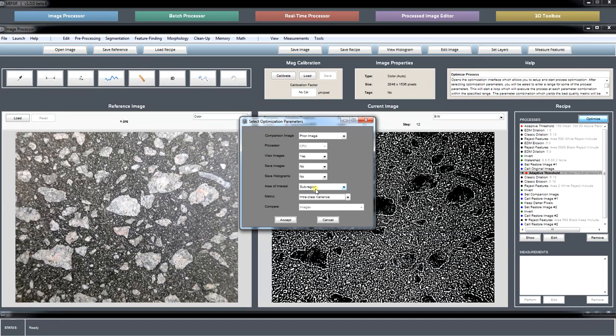So now you can imagine two histograms, those pixels that were turned black, those pixels that were turned white. You have a variance for each of those histograms. You average those two together, and you're trying to set the threshold value such that the average variance of both of those histograms is minimum. It's the Otsu method, if you've ever heard of that, for choosing an optimum global threshold value.